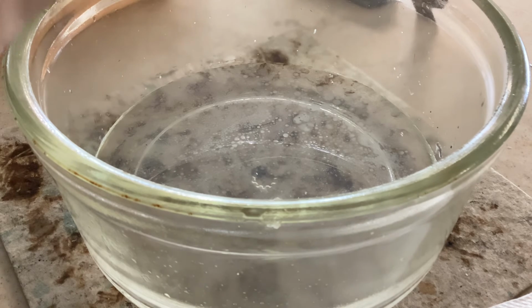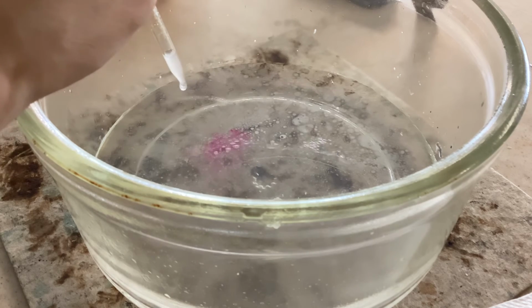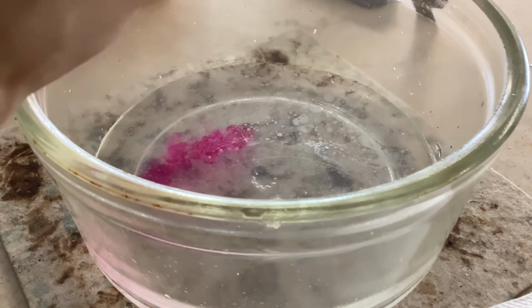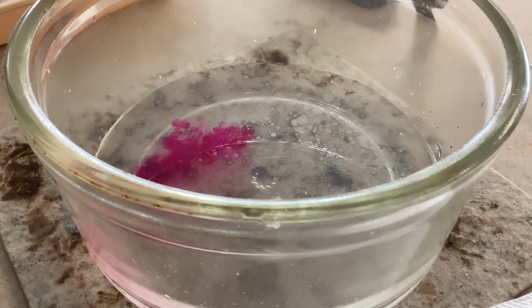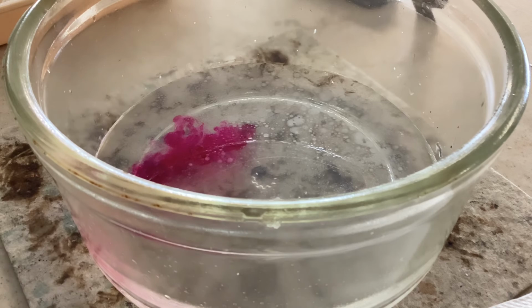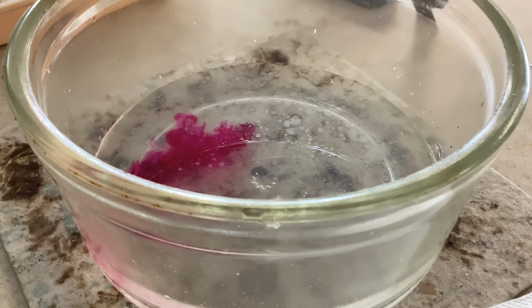Oh, and let's observe. Is it colorless or pink? Yes, it's turned pink, and our conclusion is that this colorless liquid is no longer water, but it becomes an alkaline solution.